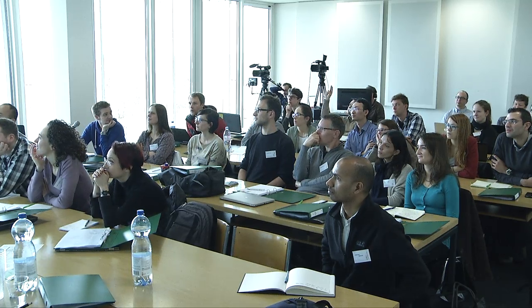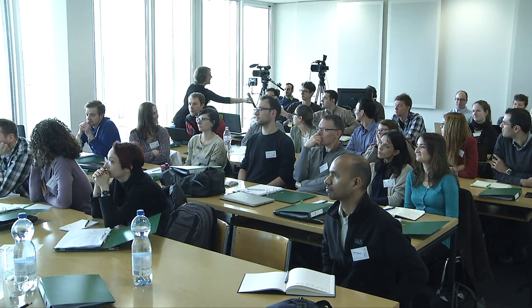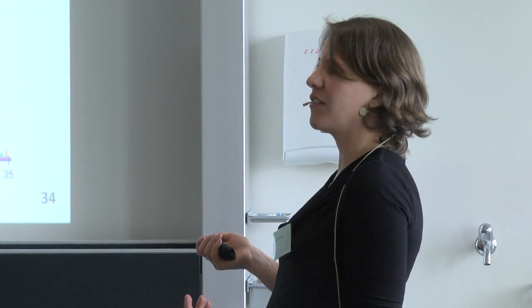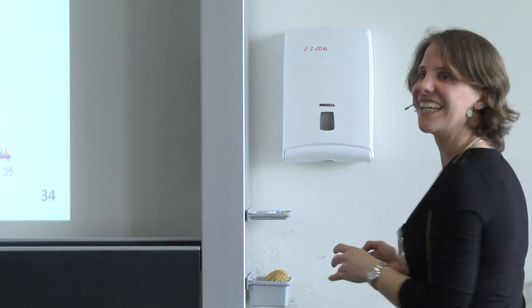Any other? Why did you use the... Sorry? Is it because of the prediction, retention time prediction? But you don't see any retention time prediction. Oh, that's here, right, yeah. Well, I'm wrong there. Next. You are a visionary. Anybody, something else? Any other idea why to pick the 23 and not the 16, or why to pick the 16 and not the 23? So the answer is that no, you know the slides, Brandon. You're not allowed. What about the number of transitions?